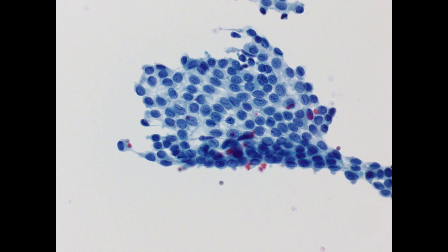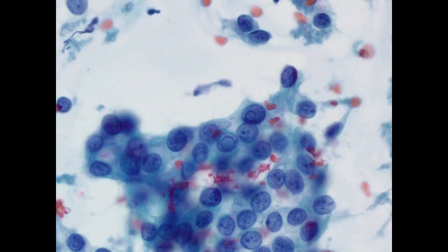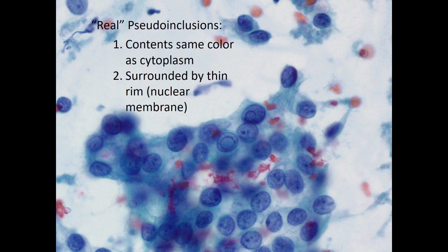On alcohol-fixed smears, we can see the nuclear detail much better and the nuclear features are much more reliable. Here we see elongated nuclei with longitudinal grooves, often described as looking like coffee beans. And here are the famous pseudo-inclusions. They should have contents that are the same color as the cytoplasm and a thin rim of nuclear membrane — these are really just invaginations of nuclear membrane reflecting the increased nuclear contour abnormalities seen in PTC.